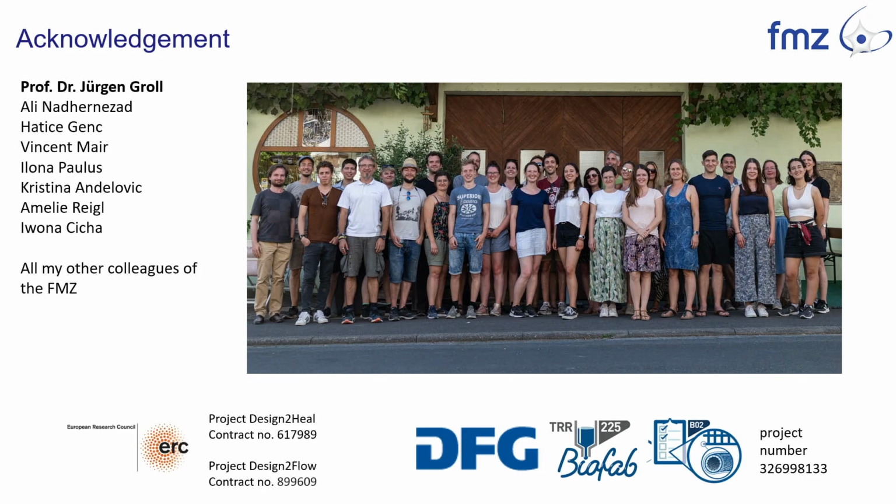You're welcome. Hello. Thank you very much for the nice talk. I have a question where I'm wondering, when you print it, you use high temperatures. What do I use? Sorry, it's hard to understand. Okay. When you print, you use high temperatures. Yes. And your sacrificial polymer is thermoresponsive. So when you add the gel around it, does it swell, and do you have some effect of this on the resolution of printing?